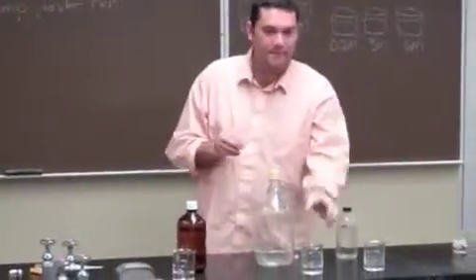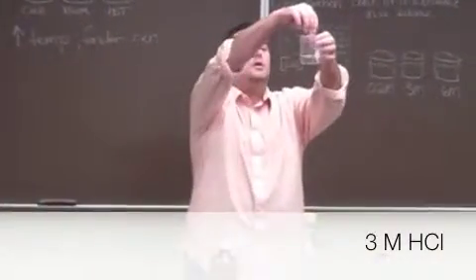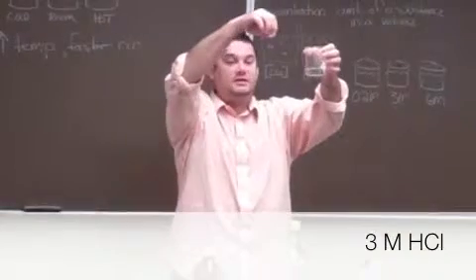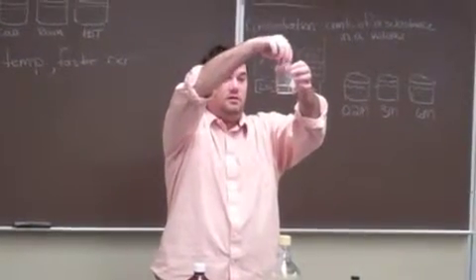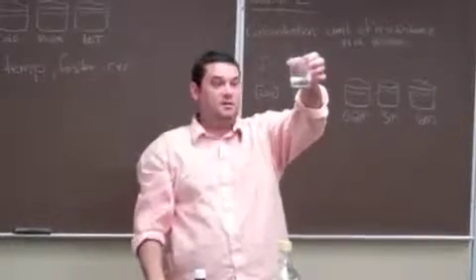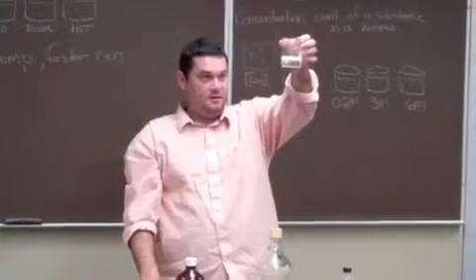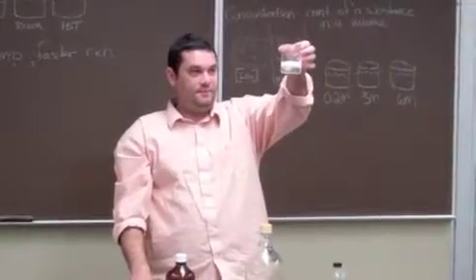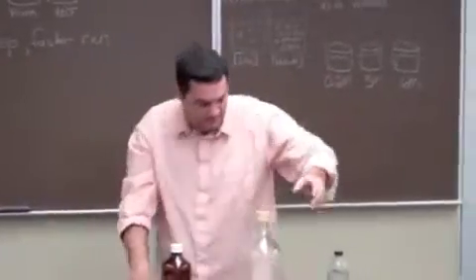Let's see what happens when I put it in 3 molar. Liquid. Oh! Quicker. Yeah, it's floating. Oh, look at all the bubbles. Okay, we'll let that go. It's like a bubble bath.